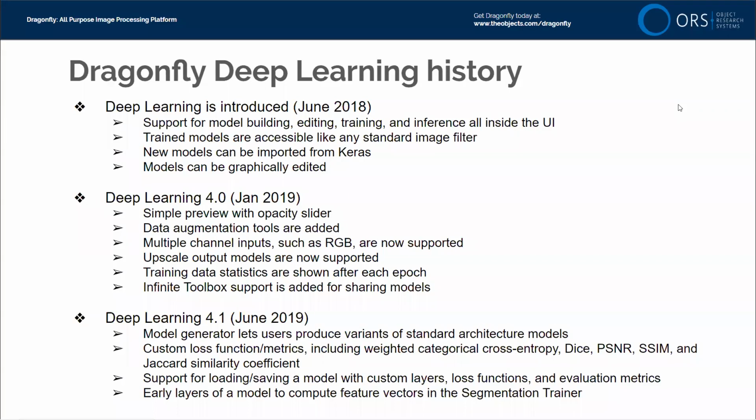We also make it possible for you to import different deep learning models. You can now use custom layers and custom loss functions and take advantage of these evaluation metrics. There was also something that we introduced, and this is if you have trained a model with deep learning, you can take the first 1 or 2 layers of that model. Now, this is a highly abstract concept that we haven't really gotten into, so some of you may follow this and some of you may not.